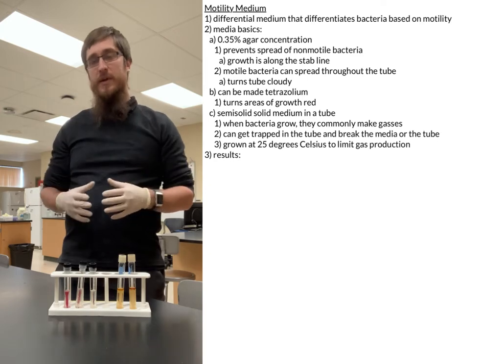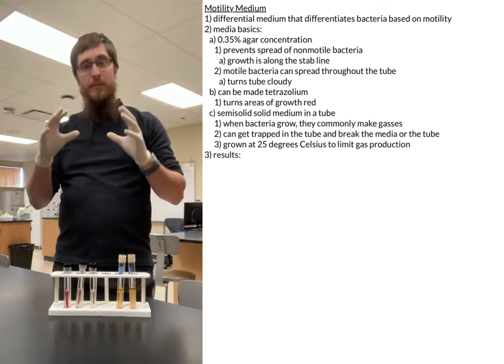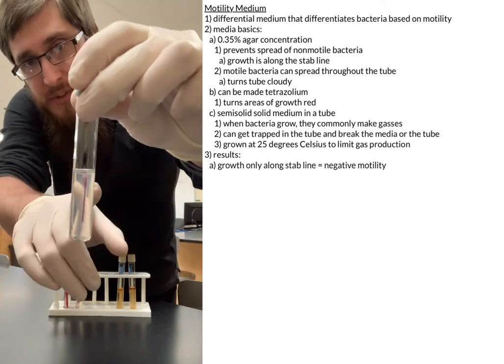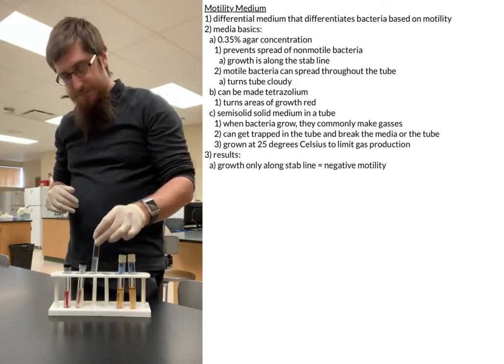So after you've incubated them for your 24, 48 hours or a week or so, depending on how long we're doing it, and we're coming back to score them. If you have growth, again, only along the stab line, like you can see here, that is going to be a negative result for motility.